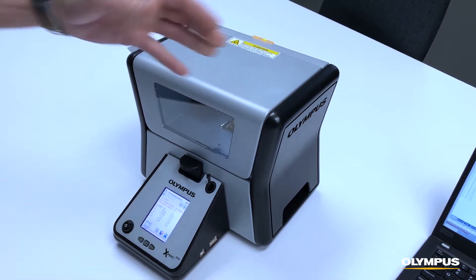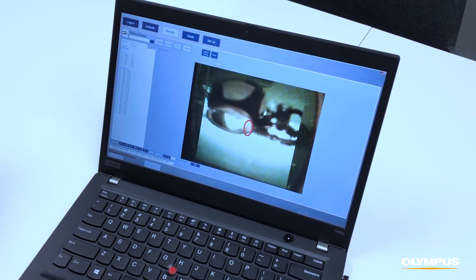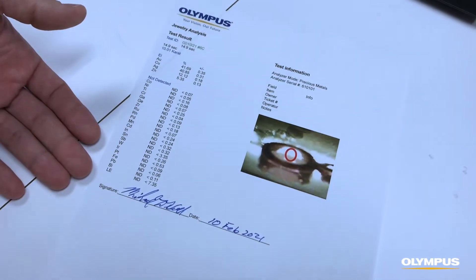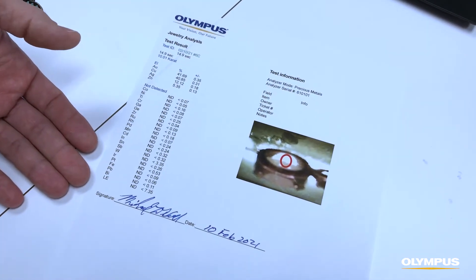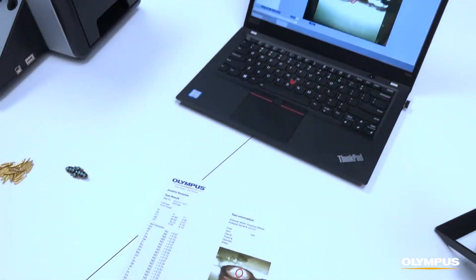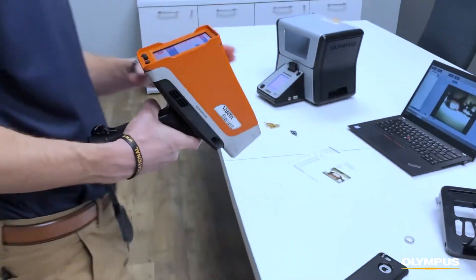The instrument comes with our free Delta Advanced PC software for sample reporting, which allows you to customize it with your company logo, show the carats and the results, and you can email or print out a report for your customer using our free software.